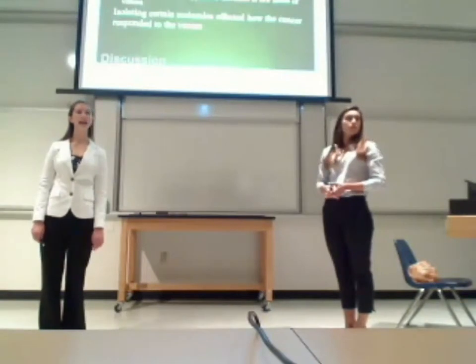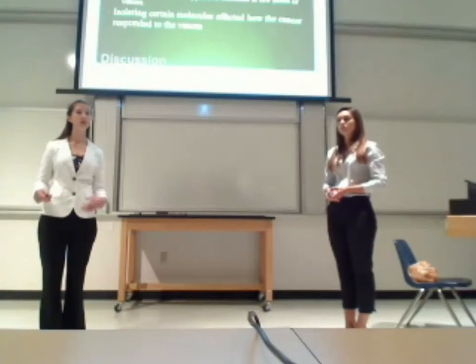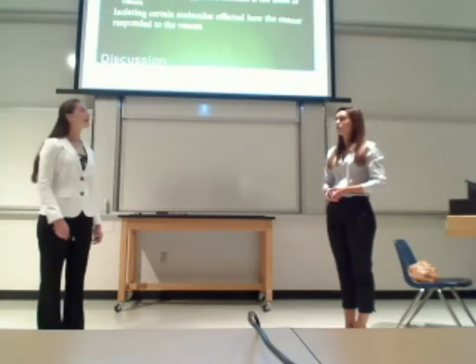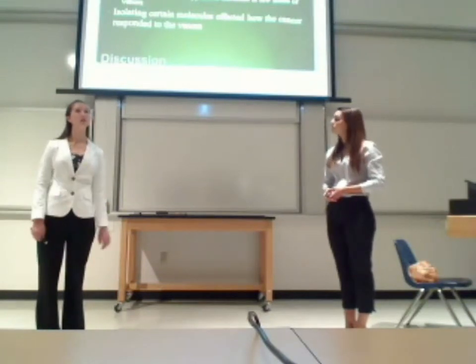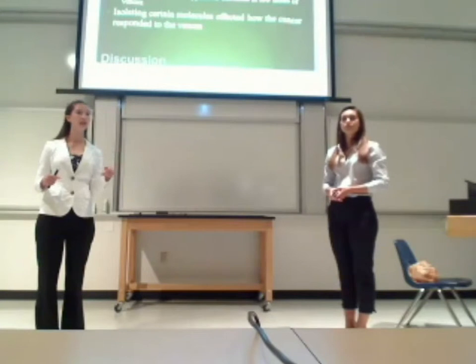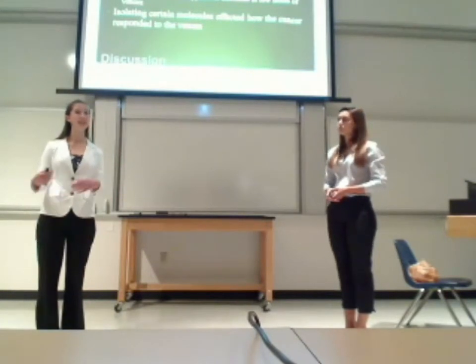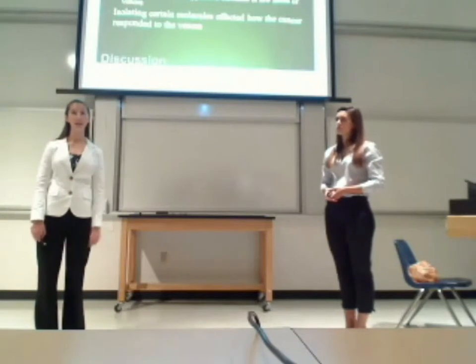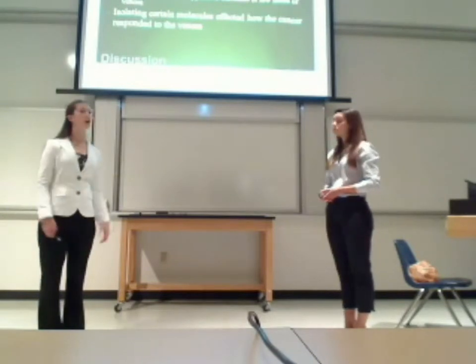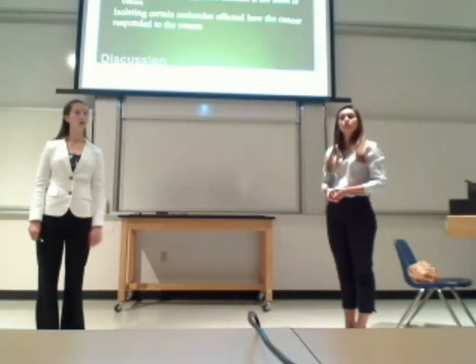We did do an MTT assay on that first peak. However, our results were inconclusive, so in the future that should be tested again. And as far as error goes, we tested everything in triplicate. On each 96-well plate we tested for the MTT assay, we did it 3 times, and we each did one. So each result that you see has been done 6 times to try and get rid of a lot of the error. We overall found that the venom from the Crotalus aquilus snake does kill both lung and colon cells.